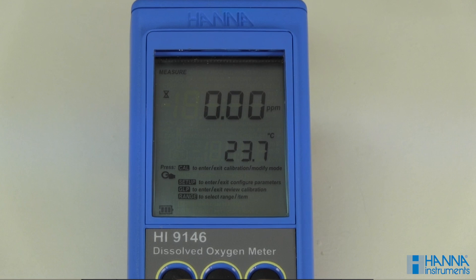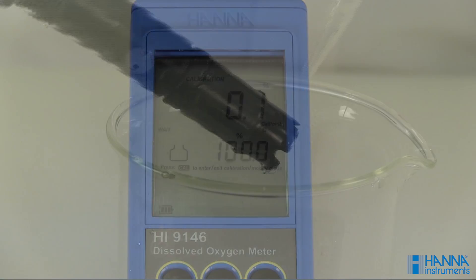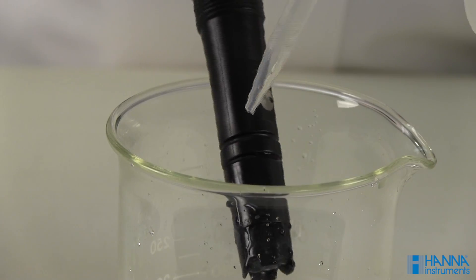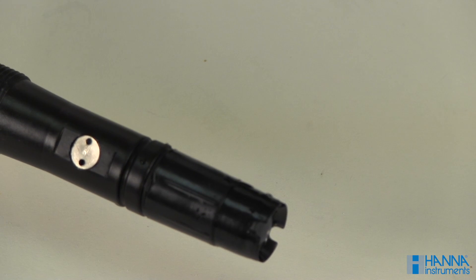After stirring a couple of minutes, press the CAL button to begin the process. When the CFM tag blinks, press CFM to confirm the 0% calibration. Remove the probe and rinse it with DI water. You can then perform a 100% calibration or escape out and put the protective cap back on.